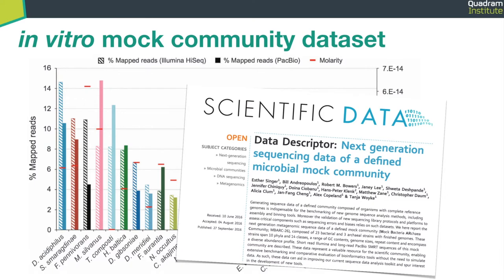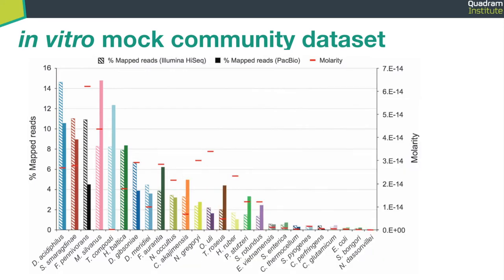Another interesting control are the so-called mock communities. This paper introduces a mock community with 23 bacterial strains and 3 archaea, all chosen because they have a finished genome. This bar plot shows the expected composition of the mix based on the molarity of each genome — look at the red bars representing the molarity — and the observed composition based on the number of sequencing reads mapped on each reference genome. The authors sequenced the mock community with both Illumina and PacBio, which is why we have two bars, and it's nice to see that there is a platform bias.